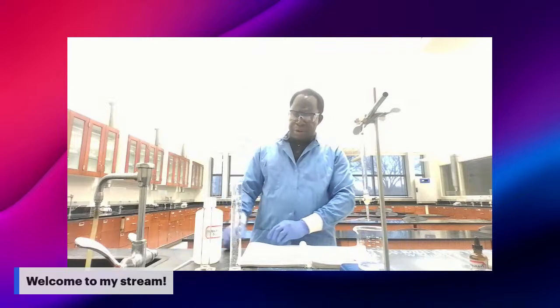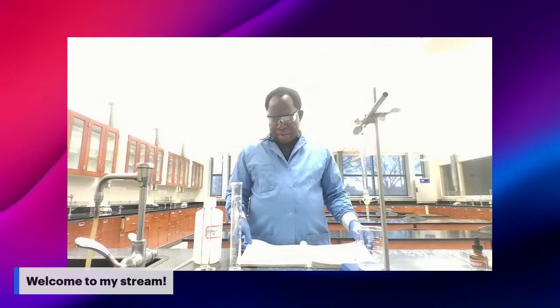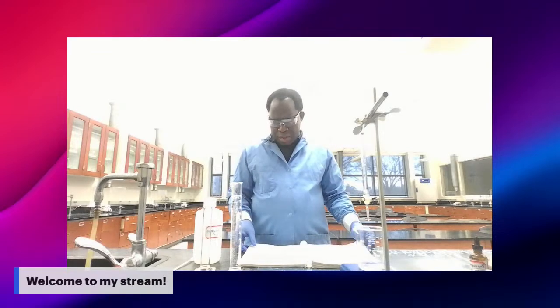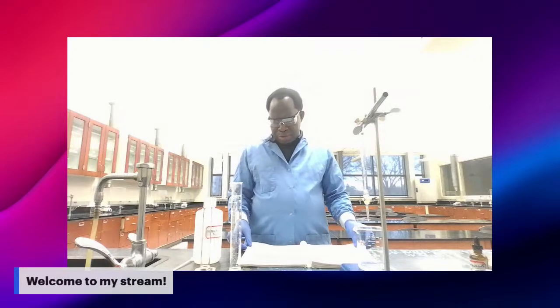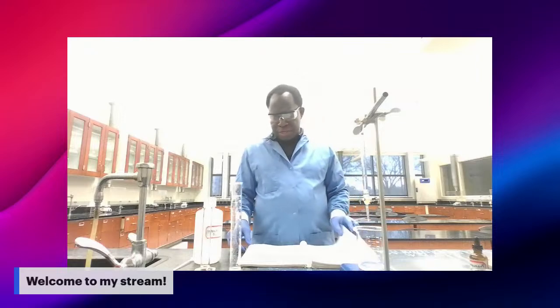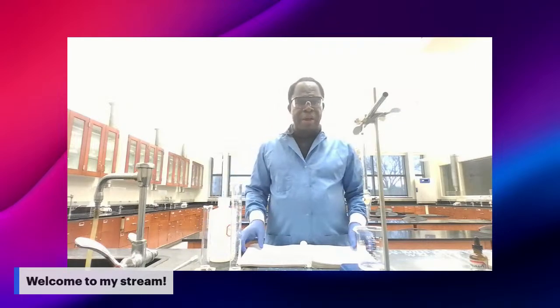Those are what you need to identify the acid. If you look in the background parts of your lab, we have what we call your lab page book. We have what we call a master inventory list. The master inventory list will help you identify which acid is the unknown acid.